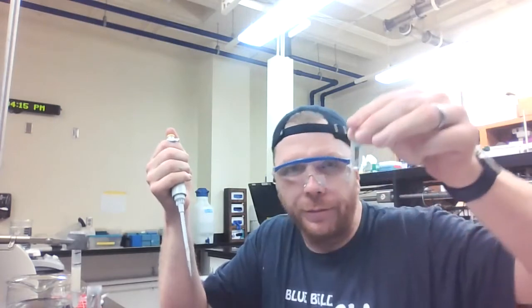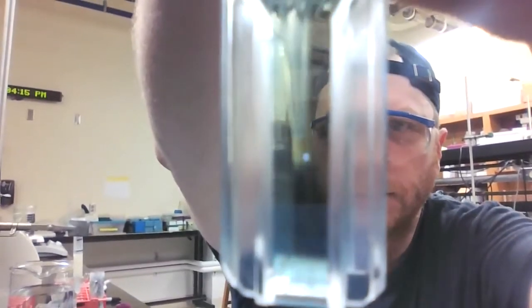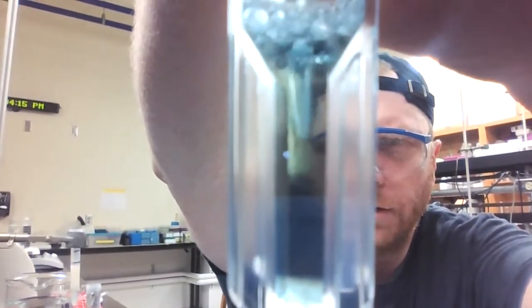Okay, so I've measured the absorbance of fractions number 18 and number 19, and here I'm about to do number 20. So I blanked here, and now I hope this is dramatic. Okay, without a completely white background it might be a little tough to see, but that did definitely get more blue, so that's an indication that proteins are eluting. The awesome thing about this is that it's an indication that there were proteins adhering to the column. And then whenever I changed my buffer, lo and behold, proteins came off of that column. So fraction number 20 here gives me an absorbance of 0.071.